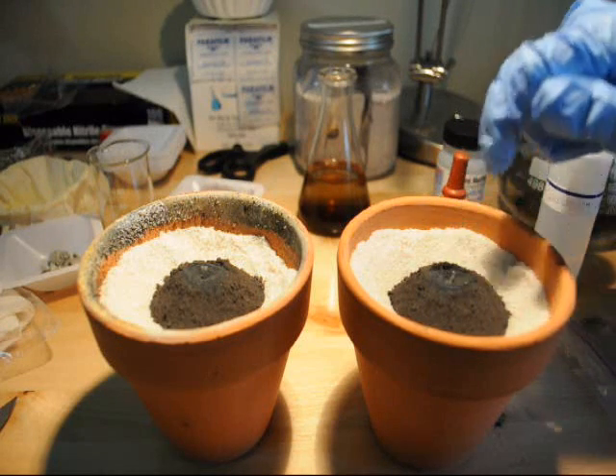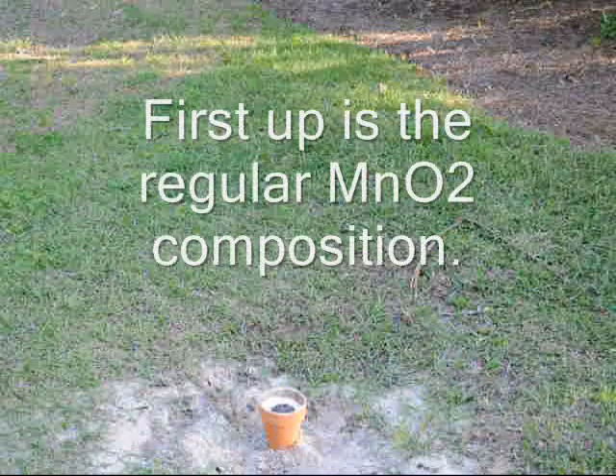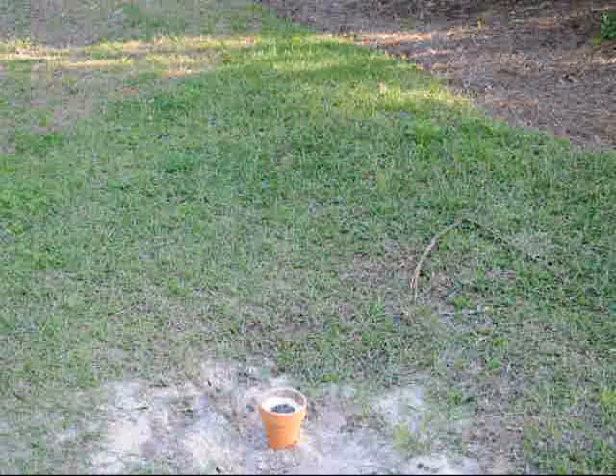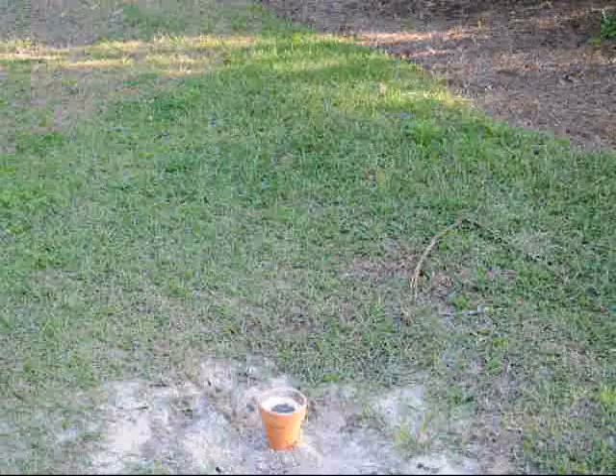So let's take these outside and see what they do. I added a small amount of glycerin and that will react with the permanganate pile on top of the thermite. It should start to smoke in 10 or 20 seconds — there it goes.